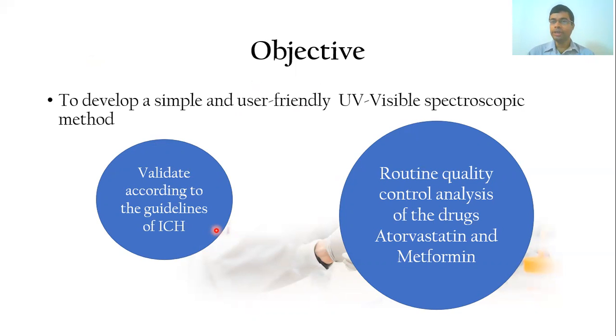In addition, we try to maintain GLP, or good laboratory practices, throughout our process, because it's very important to ensure the GLP such that our work can be redone without going back to the initial analyst or initial laboratory. And then we want to test whether our method is suitable for the routine quality control analysis of atorvastatin calcium and metformin hydrochloride, or AC and MH drugs.